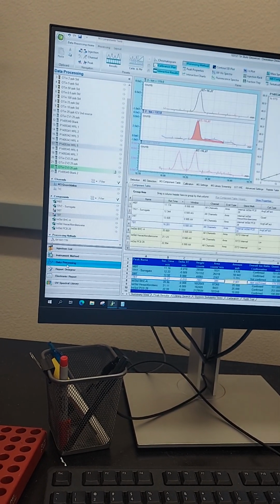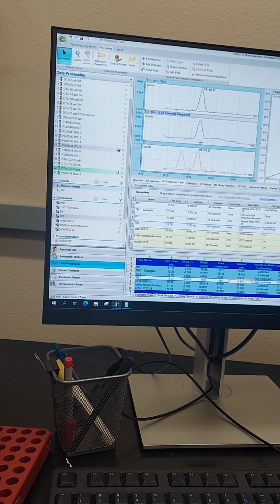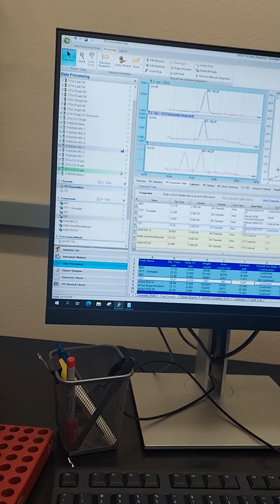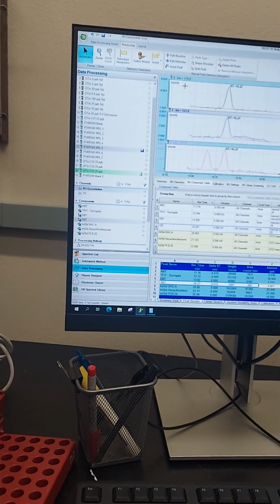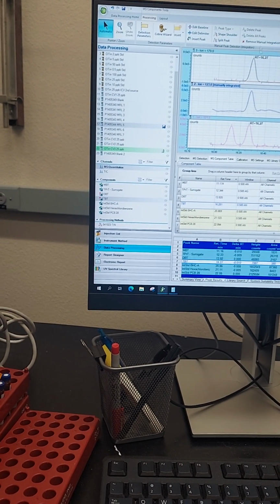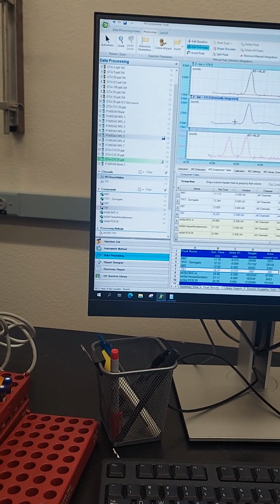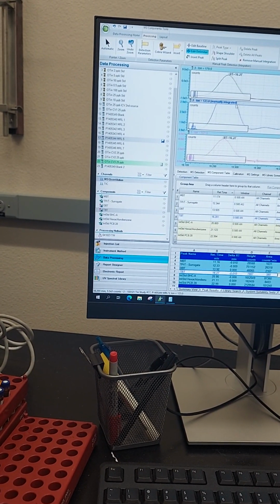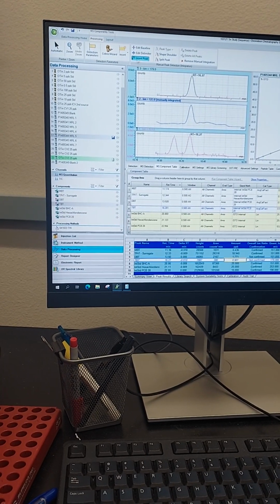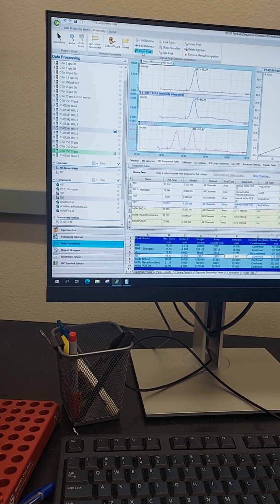Okay, go back to the data processing, and let's do the manual integrations. Click on it, click processing, click the little peaks. You don't need to click in manual integration, nothing. Just remove peak and then click with the mouse. It starts out as insert peak. If you clicked one of these, then it'll do that. So it's not working because I clicked up there. If it's not working, you've got to make sure this one's insert peak. It's for drawing that line. Usually it's already selected.